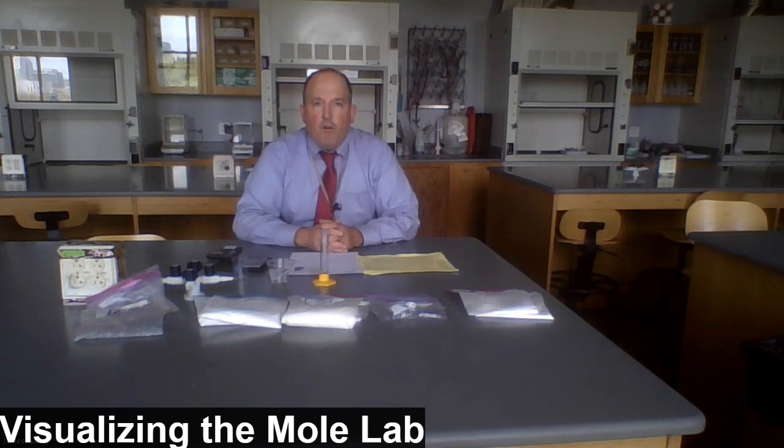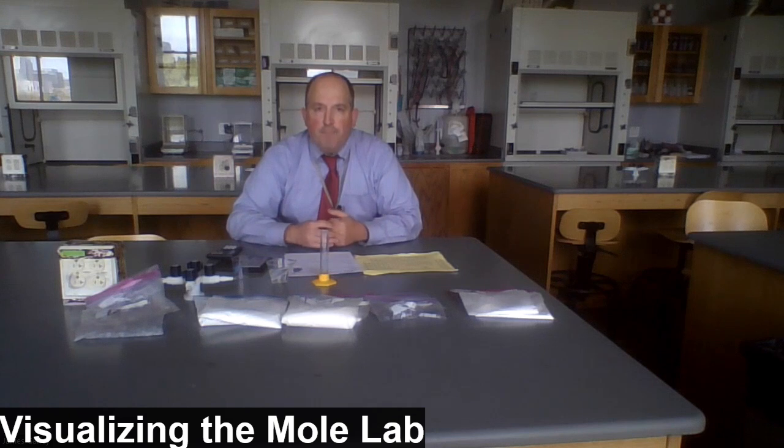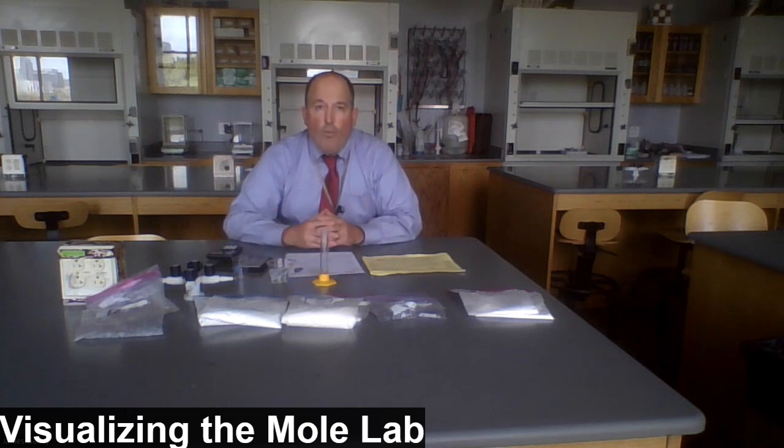This is a lab called Visualizing the Mole. As we begin to work with reactions and the quantities of different chemical substances, it's really important to get a tangible grasp of the concept of a mole. So in this lab, we're going to walk through several stations, 6 of them in fact, where we're going to be asked to either calculate or measure the amount of 1 mole of a substance.